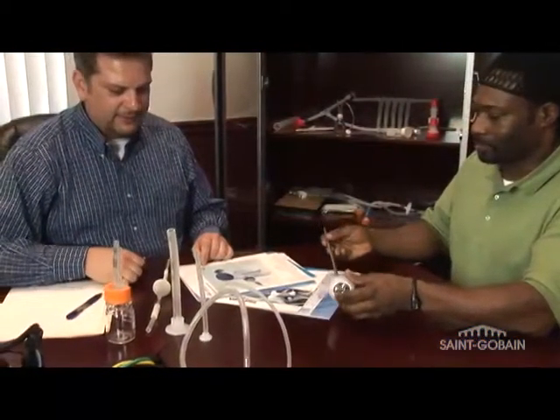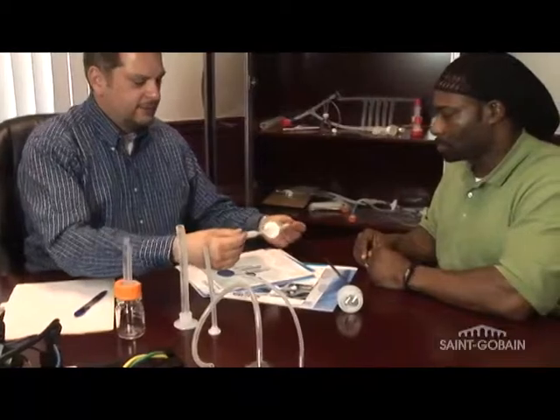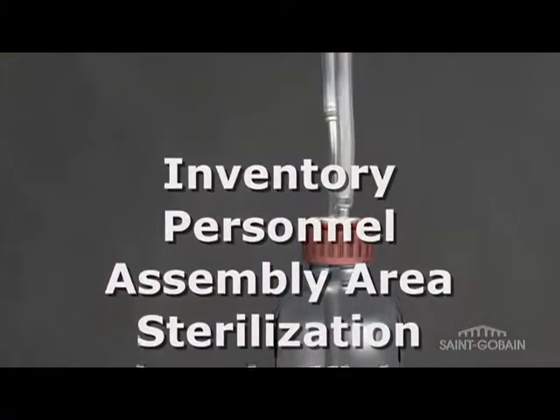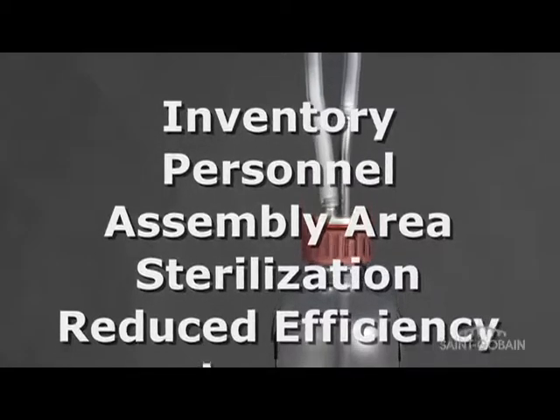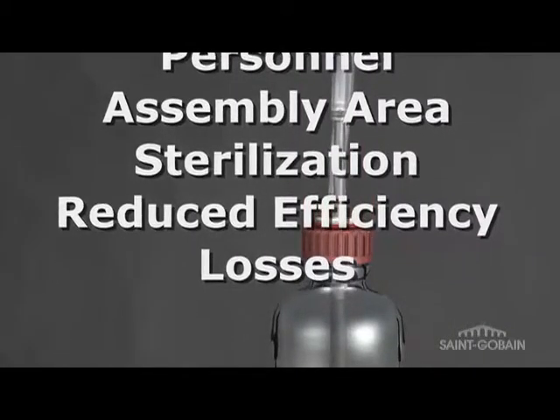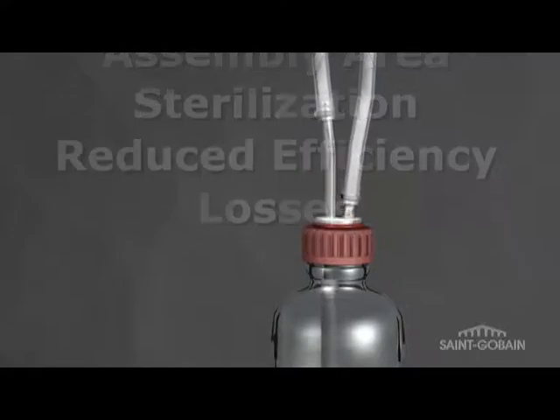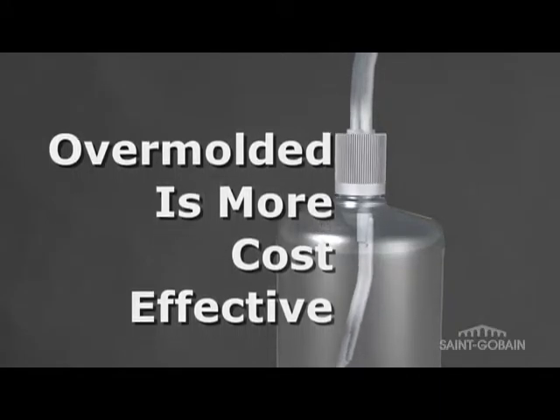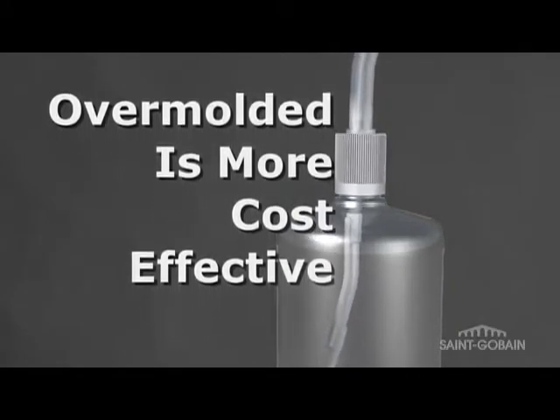End users often expect that overmolded assemblies are the more expensive solution, but if you consider all of your costs like inventory, personnel to assemble them and space dedicated to an assembly area, sterilization requirements, reduced efficiency and losses associated with inferior connections, the costs add up. In many cases you'll find that the overmolded assemblies are the most cost-effective solution.